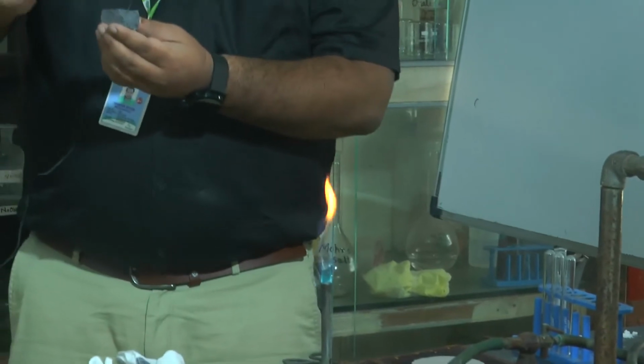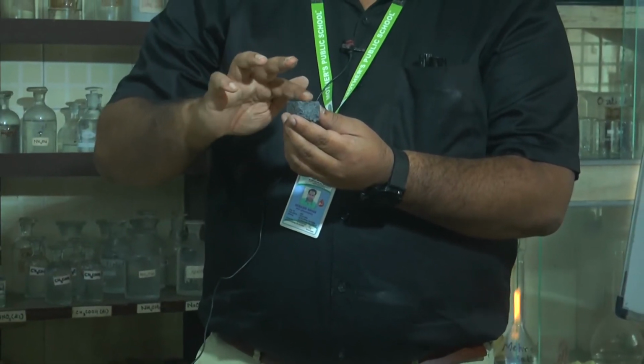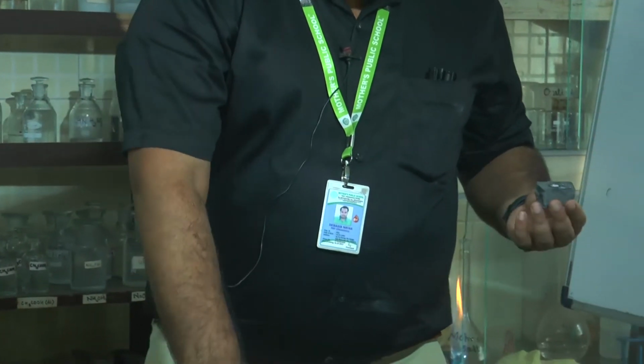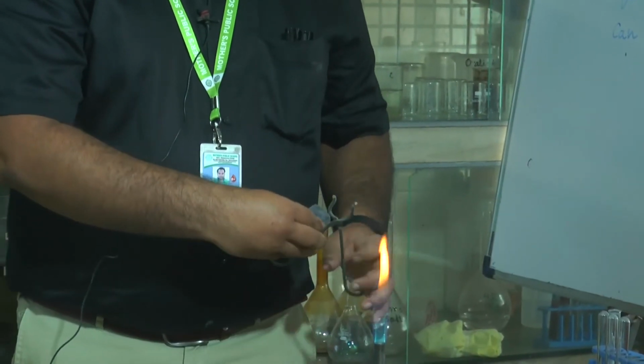Sometimes salts are dry, so for that reason just wet your finger and put it on that, and we have to do this experiment now.